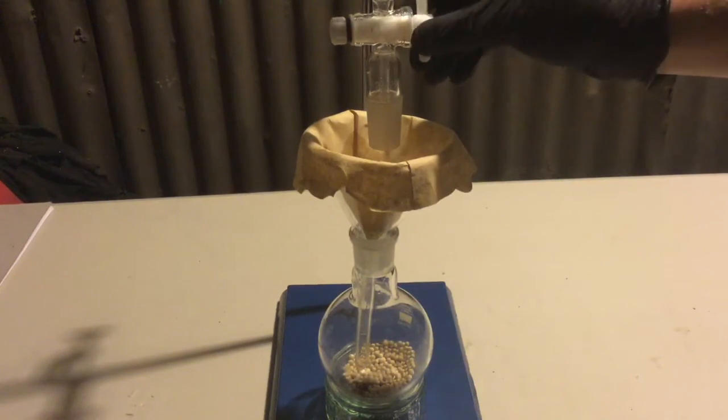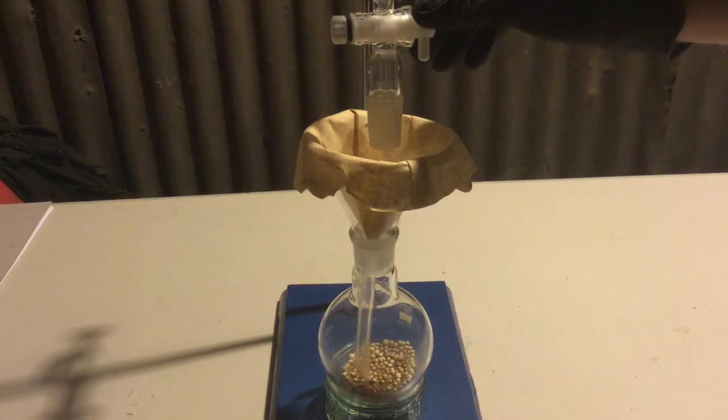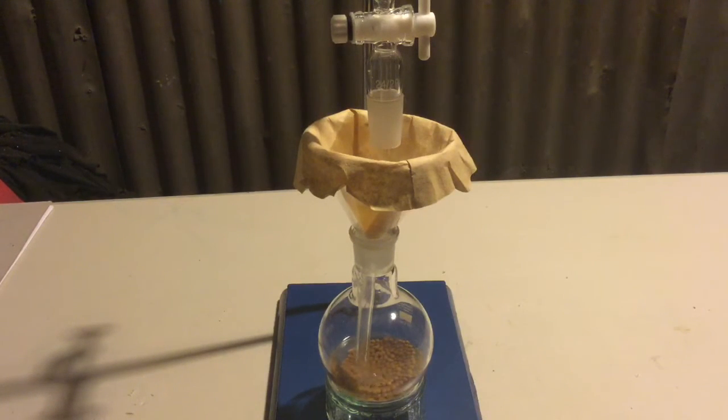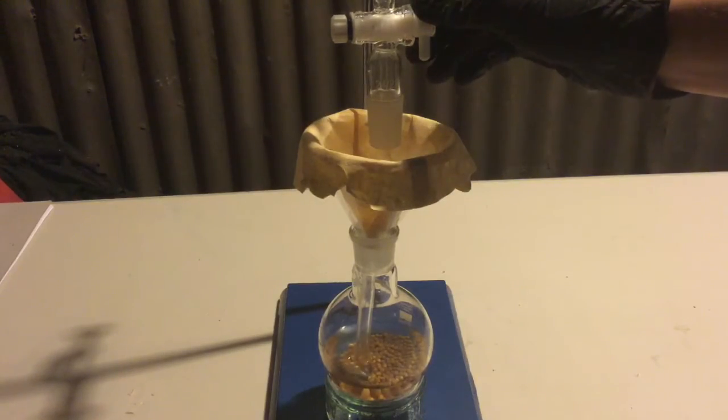The DCM was then filtered into a flask containing a fair amount of 3A molecular sieves. These sieves help absorb any of the water remaining from the water washings. The flask was then given a shake and allowed to sit overnight.